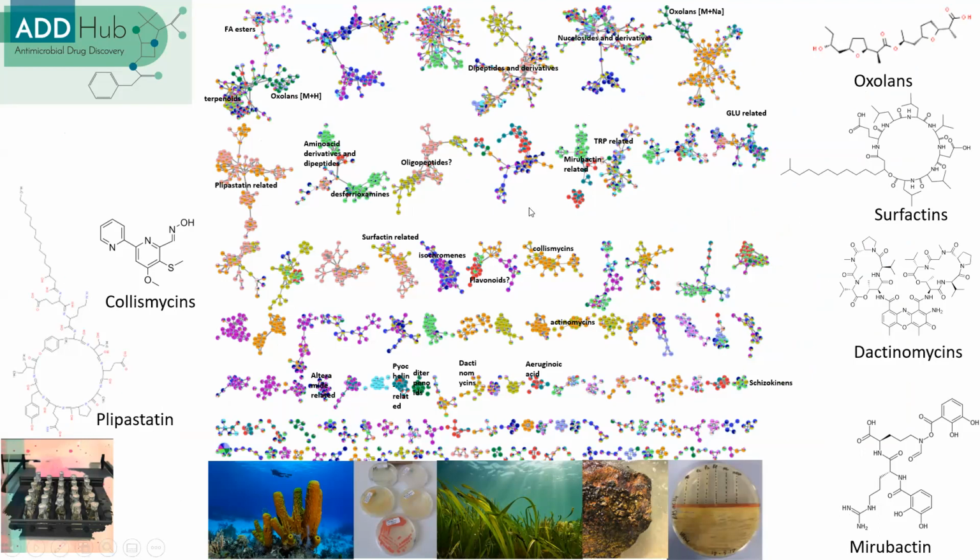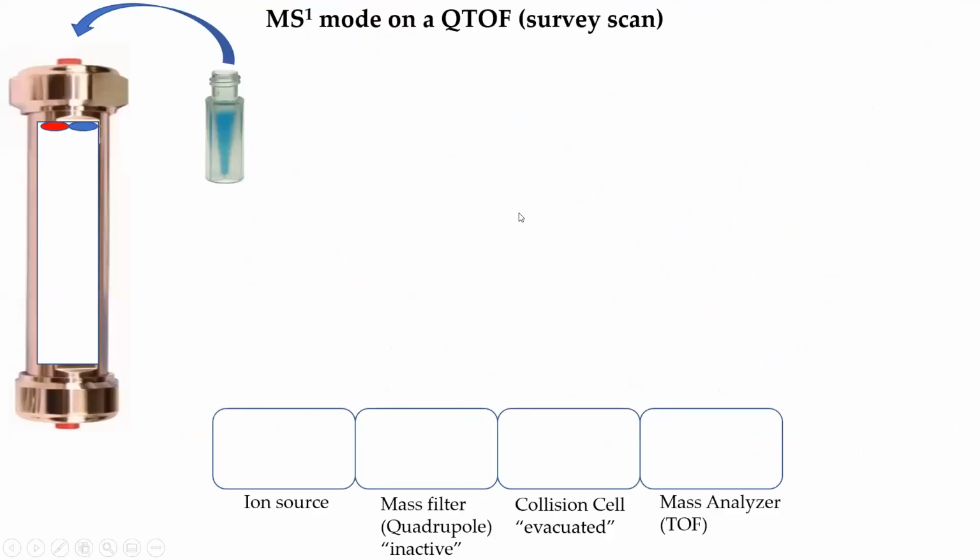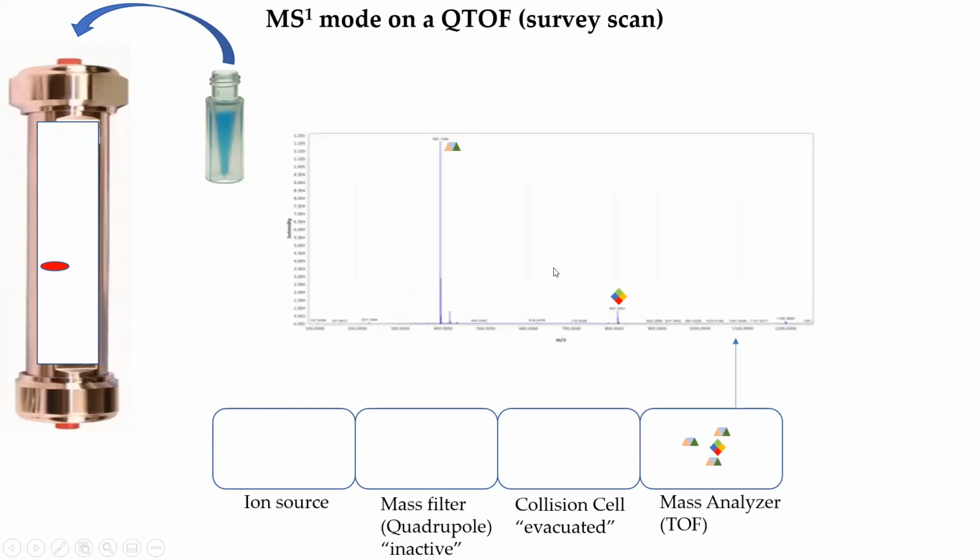All right. Just on the background, I'm not sure how familiar everyone is with mass spectrometry, or tandem mass spectrometry in particular. So I just made a quick slide of the process, how to acquire tandem mass spectrometry data. It's basically just injecting a sample onto an LC-MS. Chromatography, I think everyone's familiar with that. So basically our samples get separated. They enter our ion source on the mass spectrometer. We get a bunch of ions. They fly through the mass spectrometer and we record our mass spectrum.